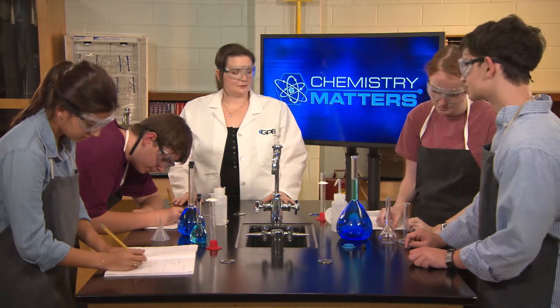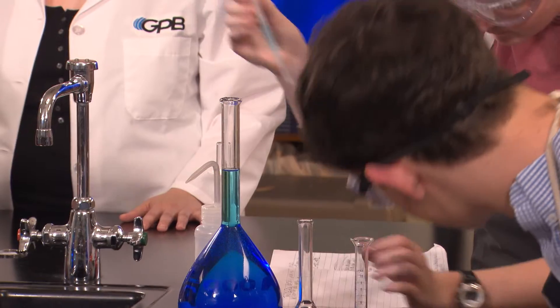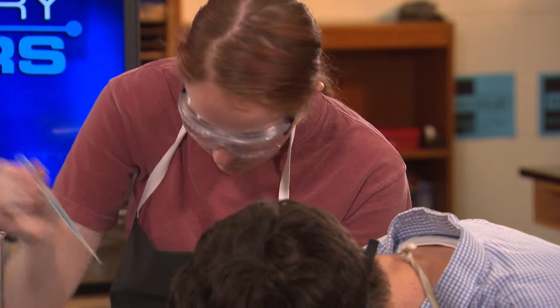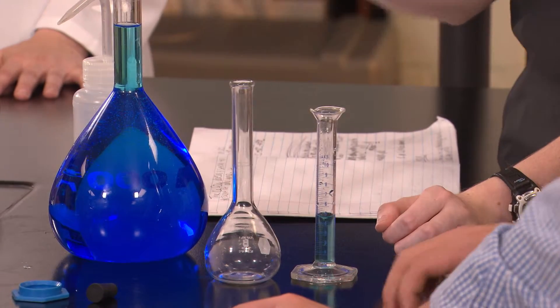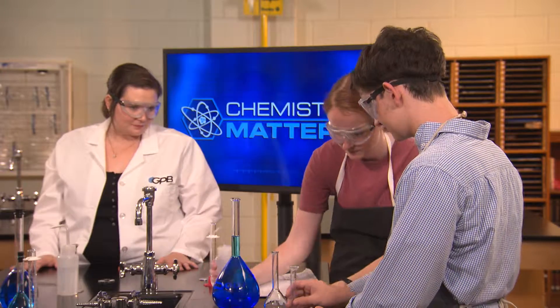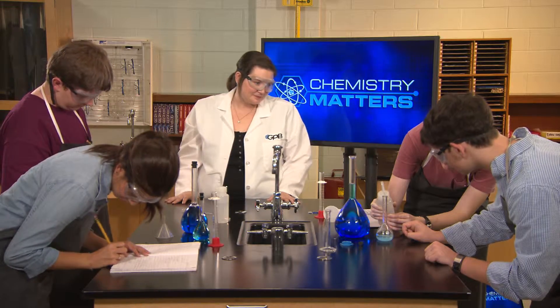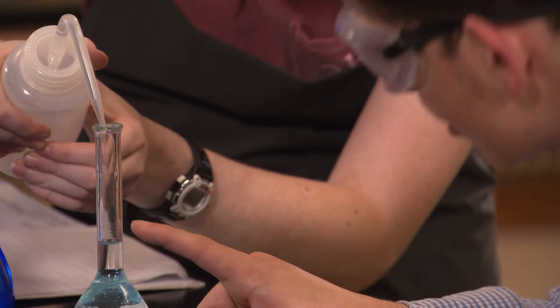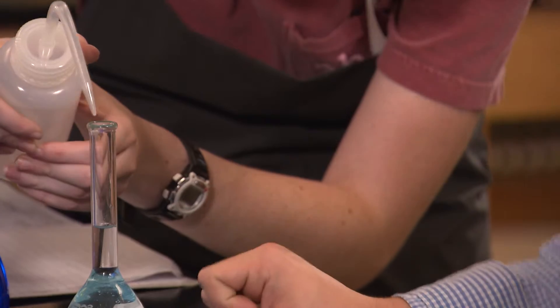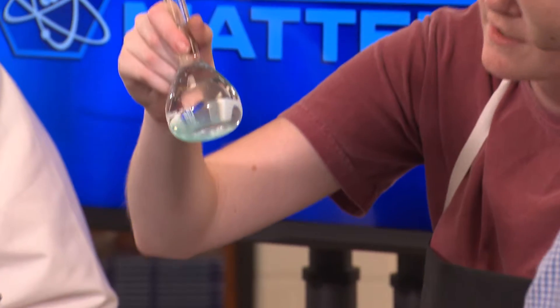I'll put in five milliliters of the copper(II) nitrate solution using a pipette. We need exactly five—stop, that's it. I'll pour that into the 100 milliliter volumetric flask, and then you can add the distilled water up to the mark. Get low and make sure you watch the meniscus. Man, that's a cool color. It's definitely more diluted now than it was before—look at how much lighter the blue is.